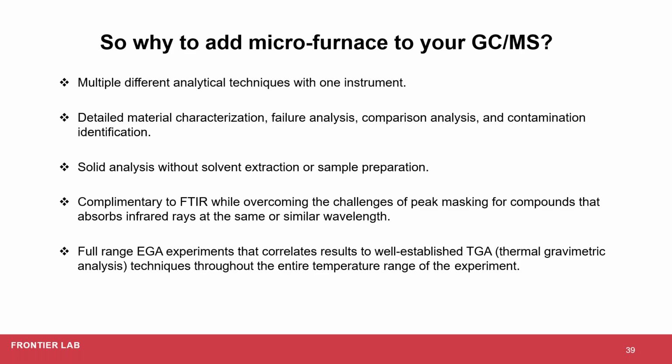And then lastly, critical for evaluation of unknown samples, the microfurnace performs a full range EGA, evolved gas analysis, from 40C to over 1000C. And that correlates results to the well-established TGA, thermogravimetric analysis technique, throughout the entire temperature range of the experiment. So I think I'm going to stop here. That's all I had for today.